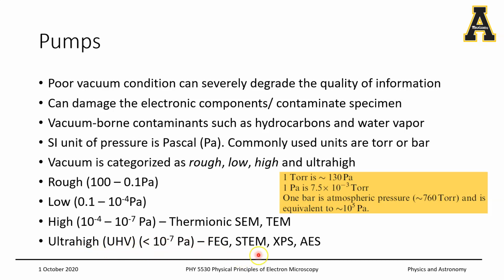And as I said, for any surface related phenomena that can be affected by surface contaminants, such as STEM or XPS or AES, you need ultra high vacuum. Okay, and over here in the box I have laid out some basic conversion relationships, just for your reference.